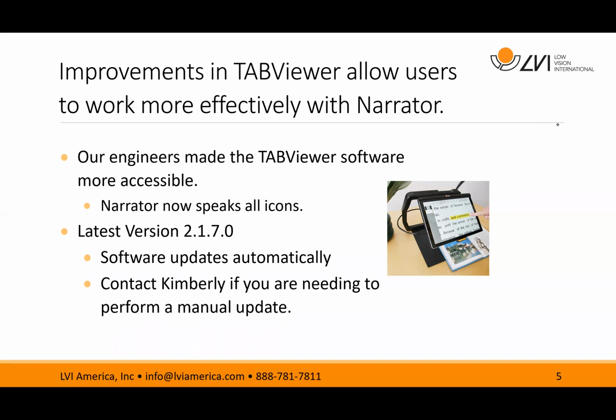If for some reason yours isn't updating automatically, you didn't happen to have your system on when those updates are getting pushed out, you can perform a manual update, and I'd be glad to get you the instructions. Just send me an email and I'll give my contact information at the end. So if you're running the very latest software, it is 2.1.7.0. If yours is not that, you definitely want to get updated.